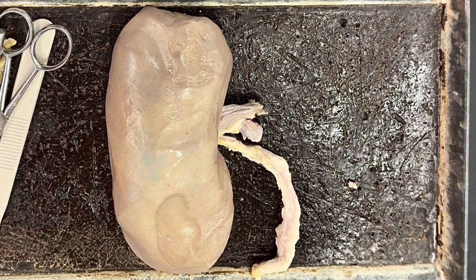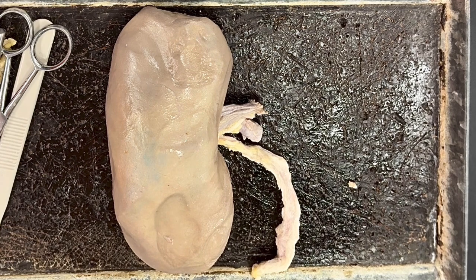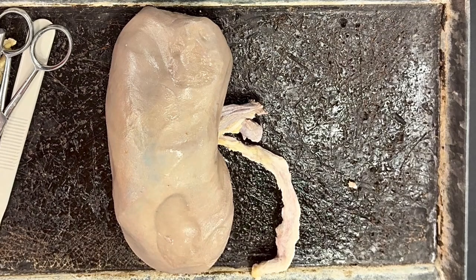Let's take a look at a preserved kidney specimen. This kidney came from a pig, and the first thing that we will go ahead and do is look at some of the outer structures that we can see, and then we're going to do a dissection. That way we can look at a few of the internal structures as well.